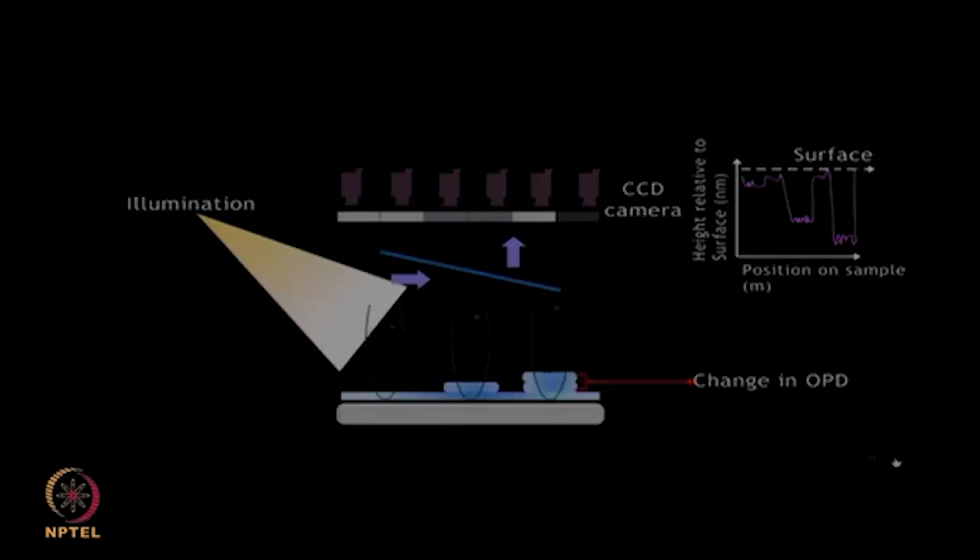The spectral reflectance imaging biosensor or SRIB therefore serves as a useful tool for high throughput real time detection of biomolecular interactions. After discussing many label free techniques, now I am going to show you an overview of some of the sensitive label free platforms which have potential to be coupled with microarray applications. Though we have discussed some of these approaches and principles in detail, it was not possible to discuss these in the context of microarrays.